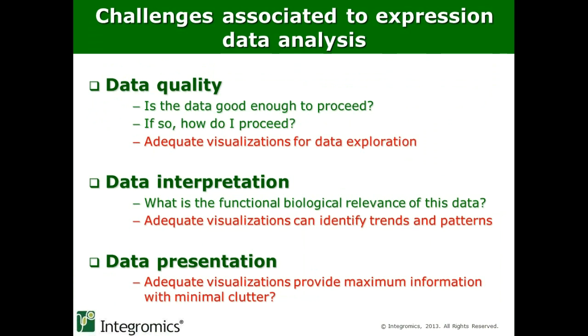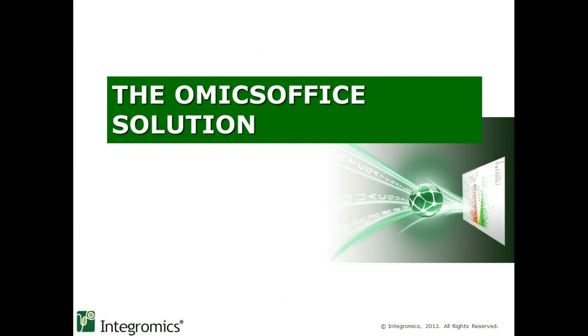So in order to address these different points, we have been developing a solution that currently addresses the analysis of expression data. And this solution would be the OmicsOffice solution that we provide.